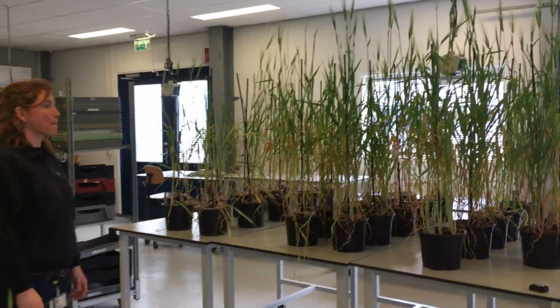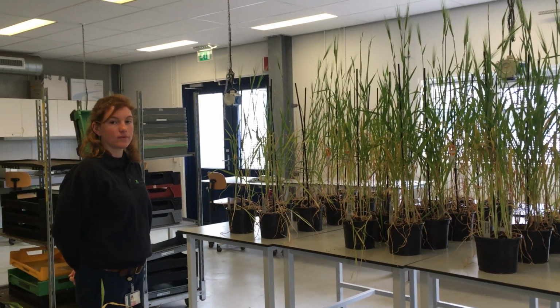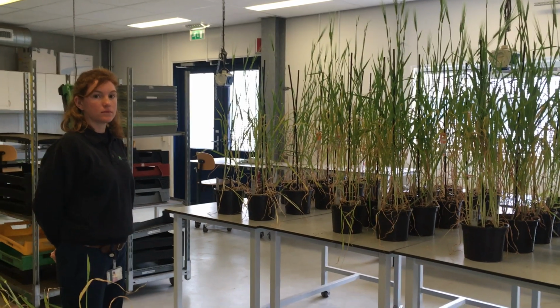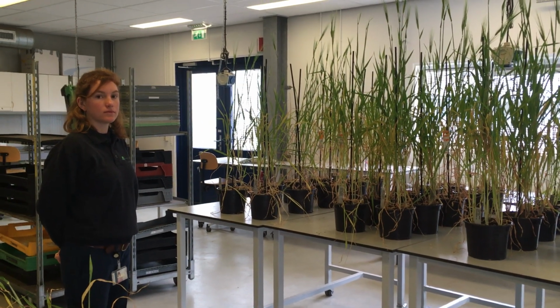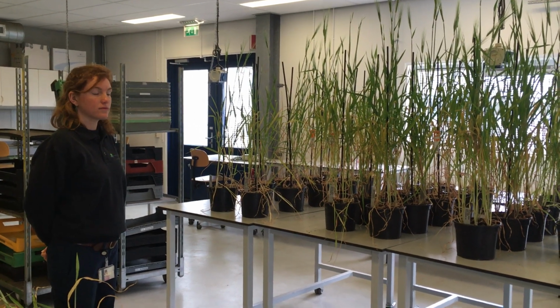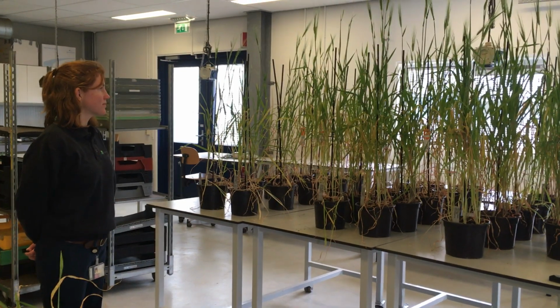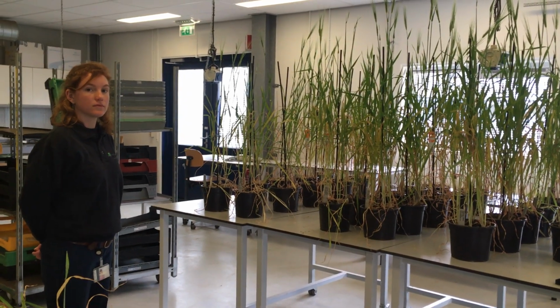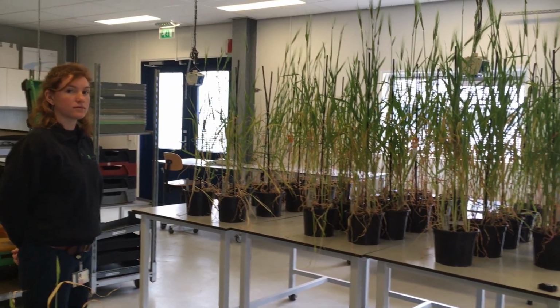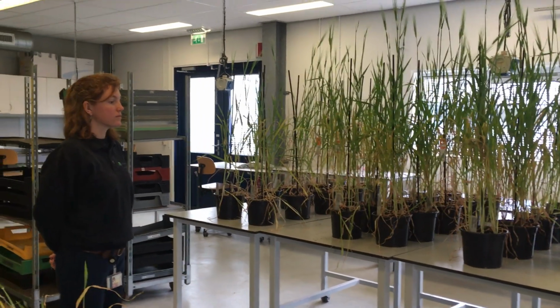And in such a way, you can take into consideration how the rich, medium, poor soil, this abiotic factor, influences the infection. I'm not sure whether they do, but based on the result data, you can draw the conclusion. Are there any abiotic influences on the biotic infection? In this case, it's barley leaf rust infection on the barley. I think we are done here.